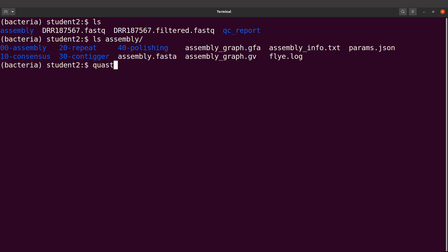You supply it with the options including your input file. There are other ways that can be used to install QUAST, and those ones require that you run QUAST.py. You need to know how you installed it and use the appropriate command. I installed using mamba, so I'll use the first approach I indicated.